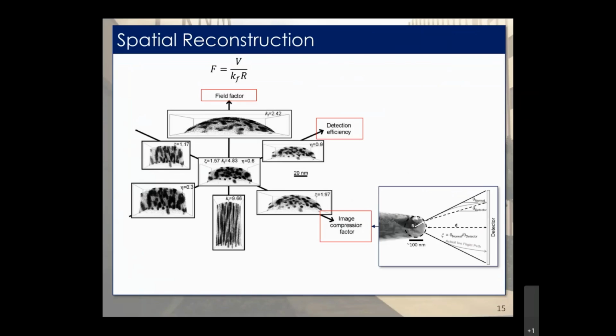Now, you might look at this figure and think, well, how can I trust any atom probe data now? You look at how much the user can put their fingerprints onto it, and they can change it for reconstructions that look nothing alike anymore. So how can we actually be sure that any atom probe reconstruction is valid for analysis? To that I'll say, to a certain degree, that's true. You should always consider an atom probe data set as guilty until proven innocent.